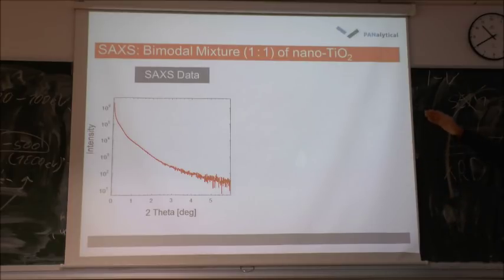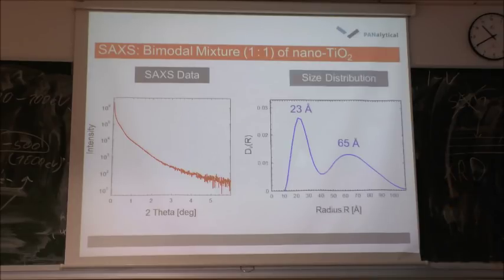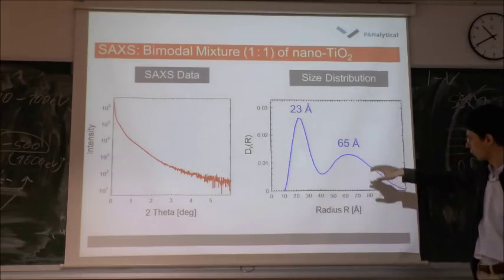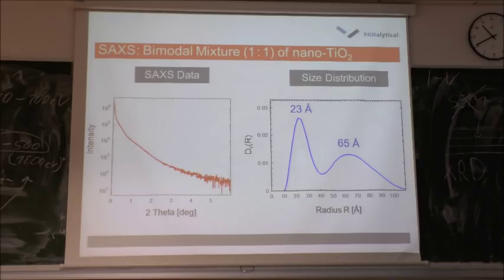With the change of 2 theta, you have a variation of intensity, and based on some models which are proposed for your materials, you can see what the volume distribution of the material is according to the different radii of the particles inside. So basically, for these particles you have a narrow size distribution, while for these particles you have quite a broad particle size distribution. This is not as accurate as real SAXS. This is so-called easy SAXS, so it's not as accurate as real SAXS.